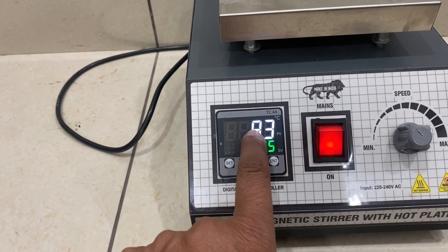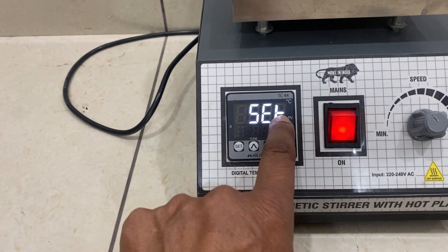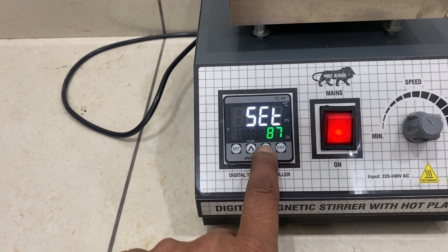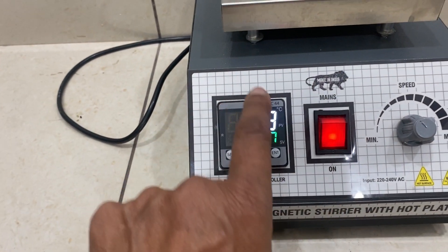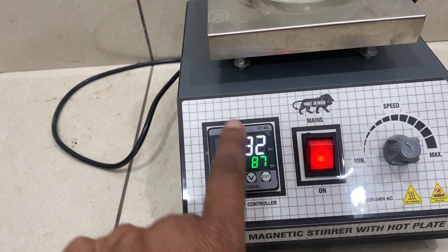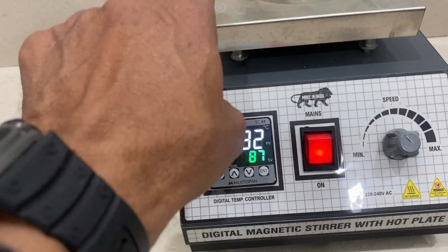As far as setting the temperature is concerned, the set temperature is 85 — this is the surface temperature controlled by the outside hot plate. You can increase it to 86, 87, and then press Enter. Now it is showing we are trying to attain 87 on the surface. The chemical will always be 20 to 30 degrees less.